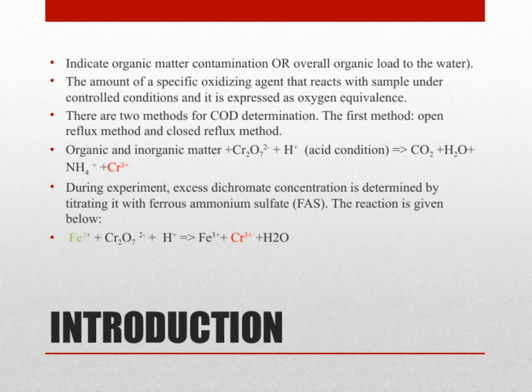Let's talk about the concept of organic matter contamination, or the overall organic load in water. Essentially, we're measuring how much organic material is present, which can impact water quality. One important way to do this is by using the chemical oxygen demand, or COD, test. This test tells us how much oxidizing agent is needed to break down the organic matter under controlled conditions. The result is expressed as oxygen equivalents, giving us a clear idea of the organic load.